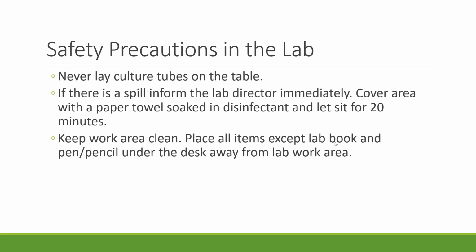If there's a spill, you're going to have to clean that up, and there are proper ways. A lot of times you're going to put paper towels that have a disinfectant on it and let it sit, but always contact the lab director to help you get that cleaned up.